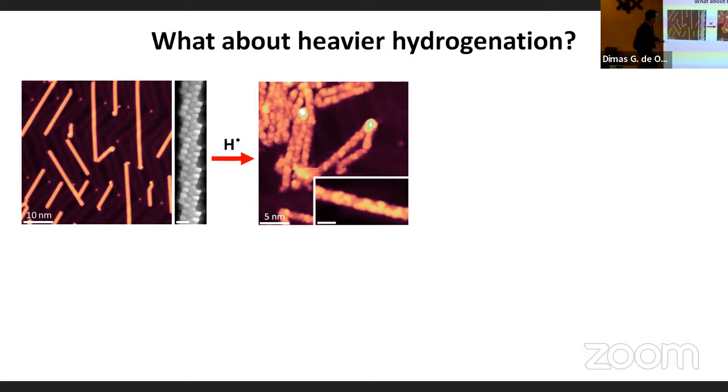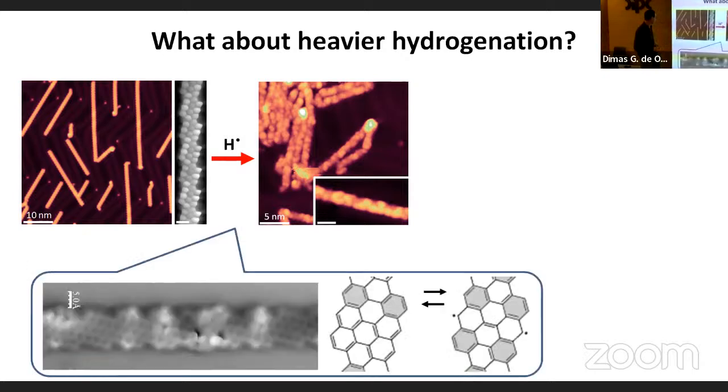And well, if you hydrogenate the samples only very lightly, then you can see a little bit how the hydrogenation starts. This is what I show here with some non-contact AFM images. You can already see that the most commonly hydrogenated places, where it starts, are again these same central positions here. That's because this is where the highest radical character is on these structures. The next most common positions are these central carbon atoms, basically these two here. That's because these carbon atoms are the only ones that you can now modify without breaking or affecting any of these stabilizing Clar sextet states. So this is where it first hydrogenates, this is where it hydrogenates next, and then anything else comes and you end up with this mess.